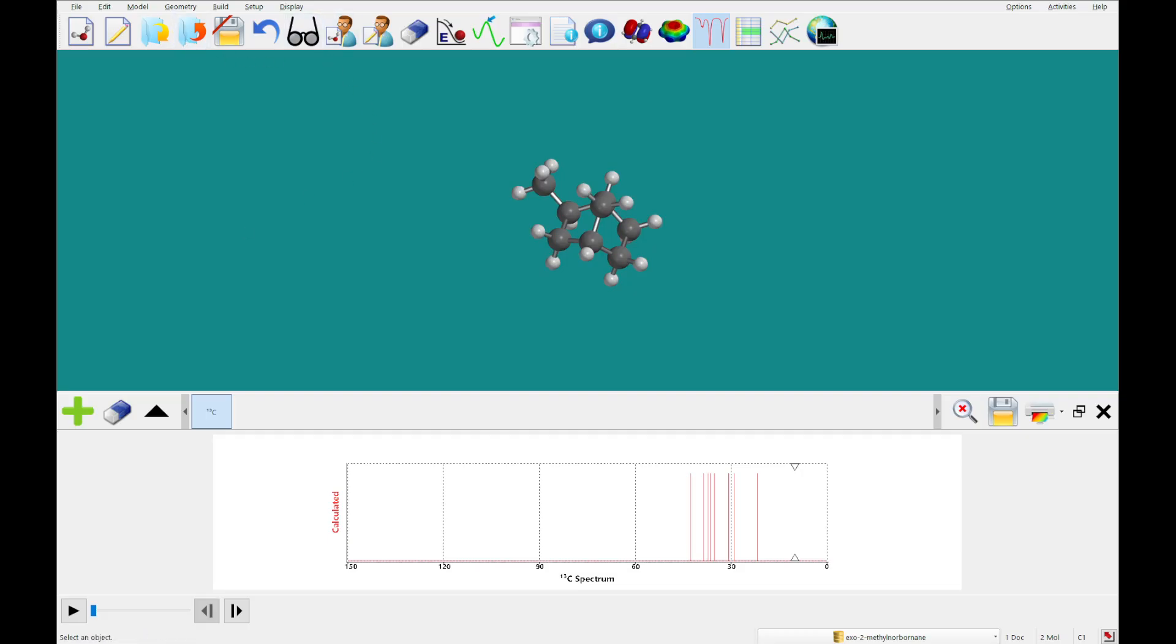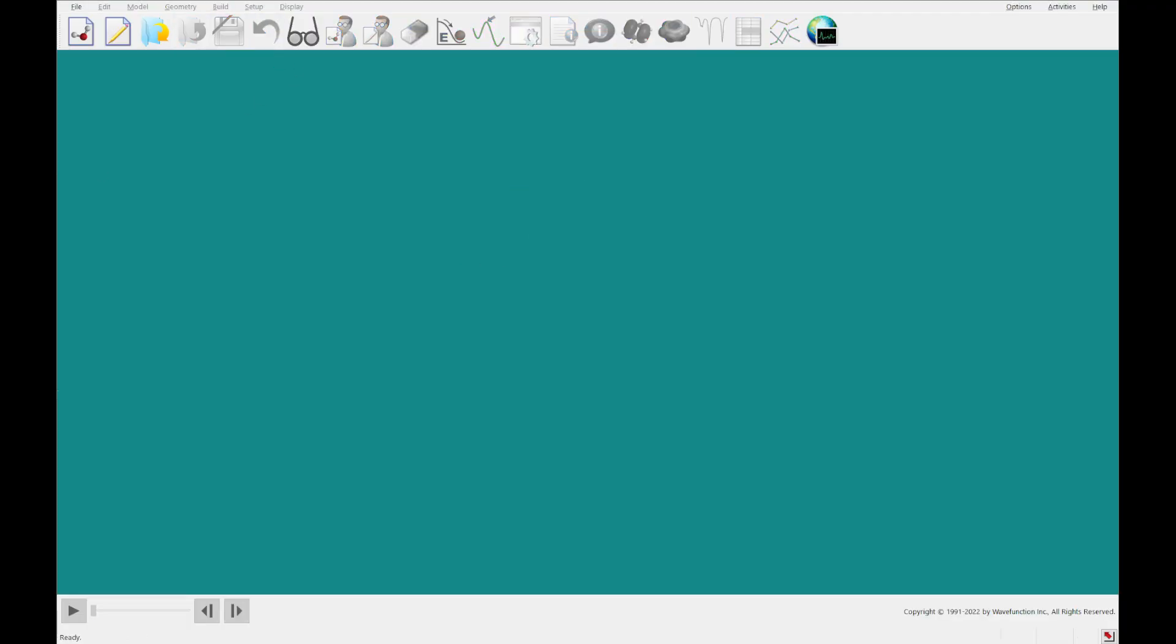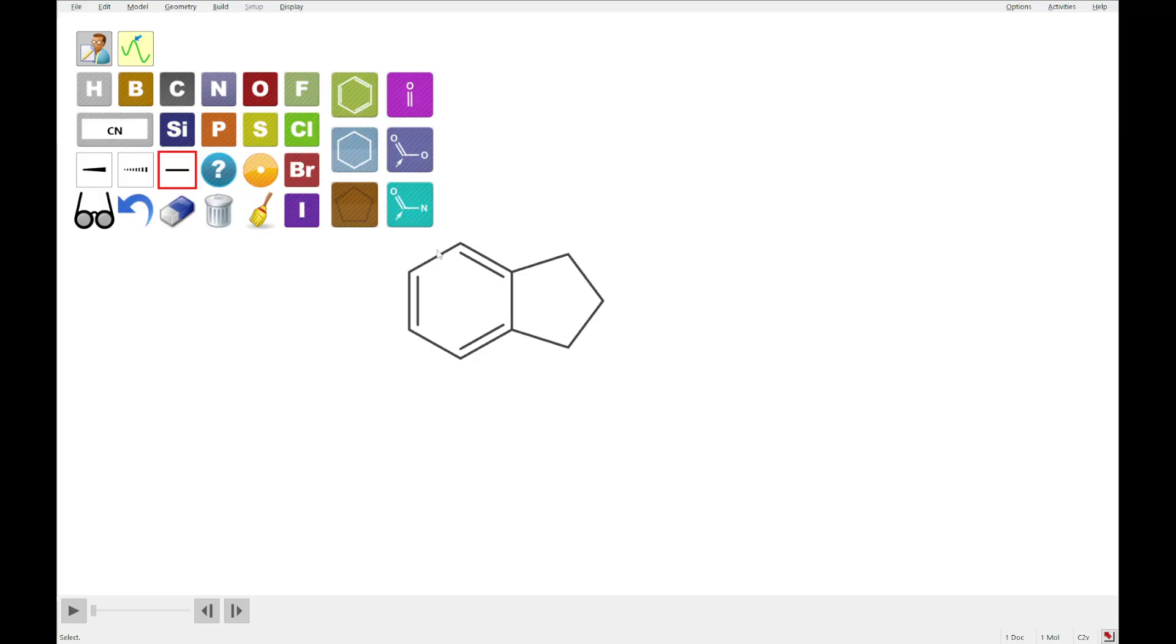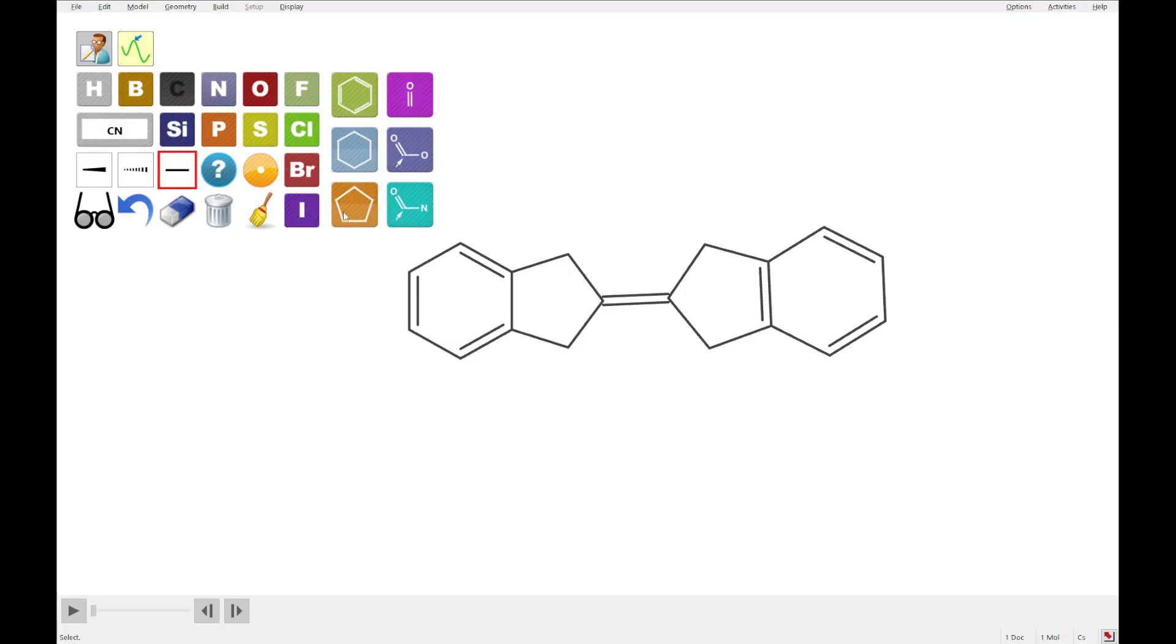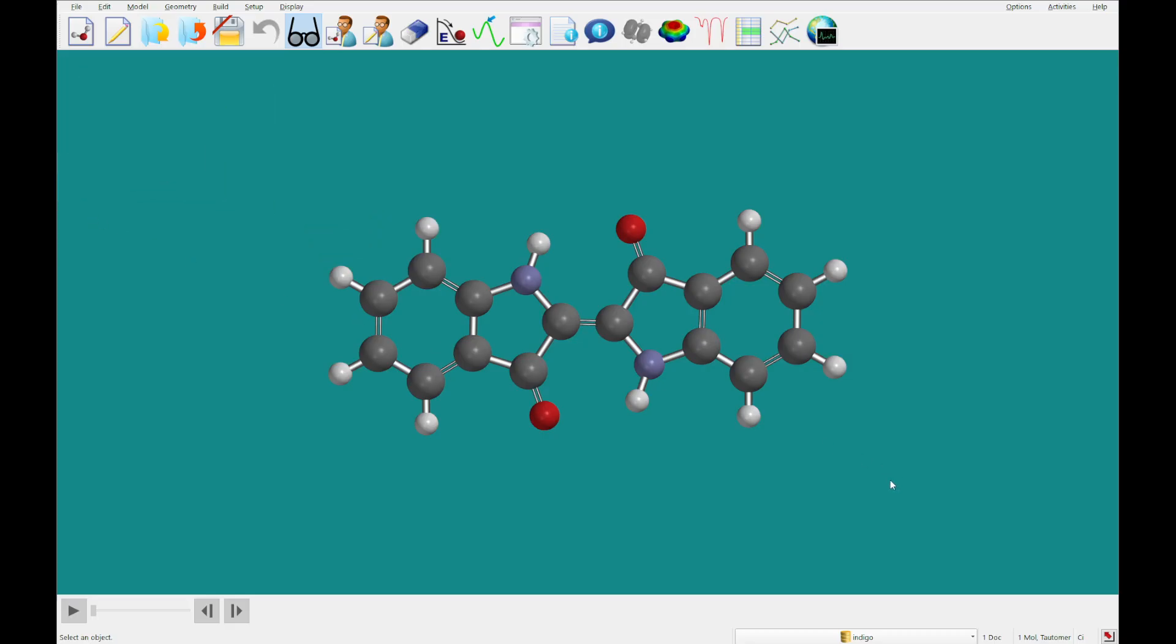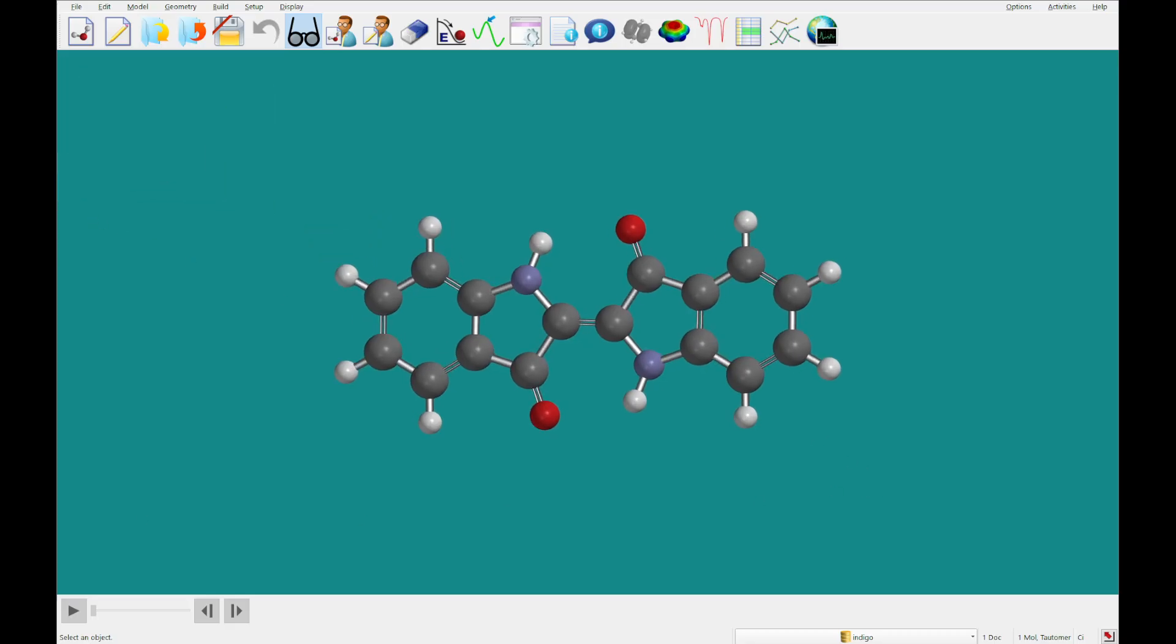Alright, so I am going to close out of that. And so the last thing that we are going to look at today is the UV visible spectrum of indigo. So there's some background information on UV visible spectrum, which is new in Spartan Student Version 9, that you're going to want to read through. And then once you've gotten through that, you're going to want to build your indigo. So I am going to sketch that here. I'm going to put the nitrogens, the oxygens, and we should be all set. Okay, we've got our indigo there.